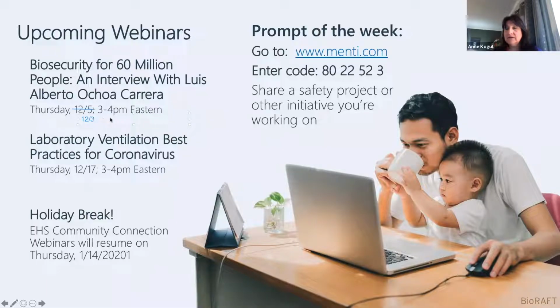However, now that we've done an online inventory that is also tied to a safety data sheet management system, someone can go through their inventory and click on the latest, and that's an outside provider. So everyone has access to that across the campus for compliance. When a chemical comes in, it's supposed to be added to their inventory, and then the search is available to anyone on campus for any of those chemicals.